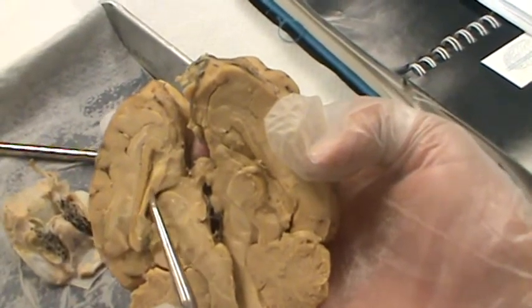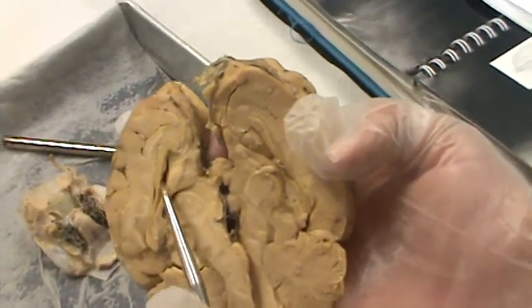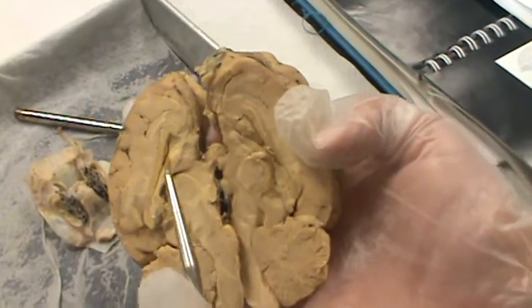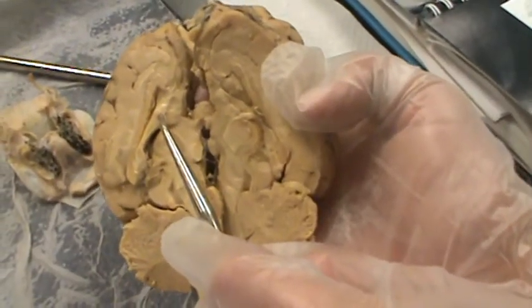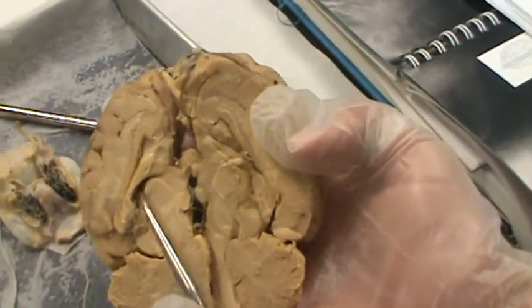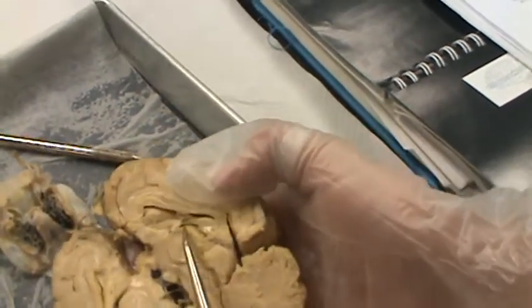The fornix is going to be the lower part of the corpus callosum. This is the fornix. It's between the lateral ventricle and the thalamus. Fornix. The third ventricle is between the thalamus and the fornix, which is this area right here. You can see it right here.